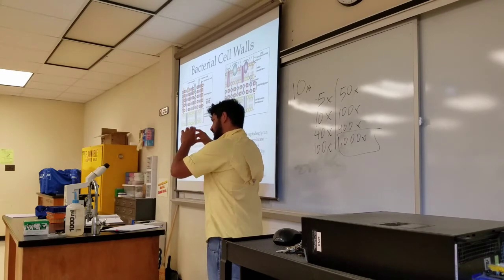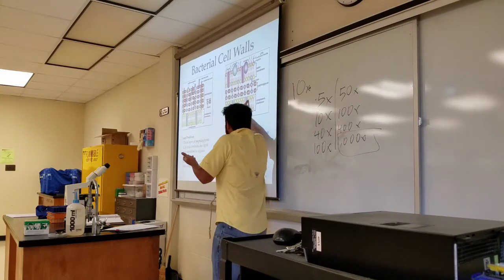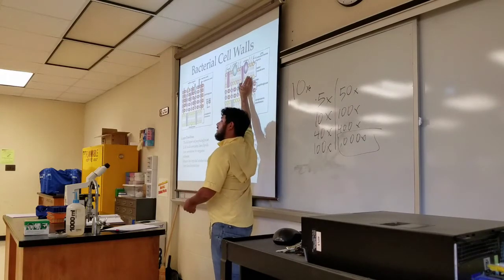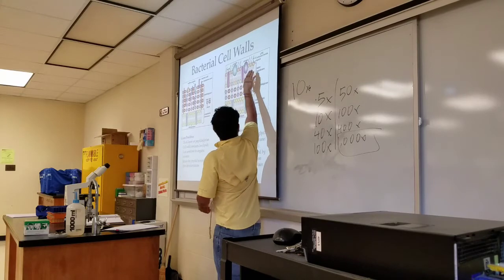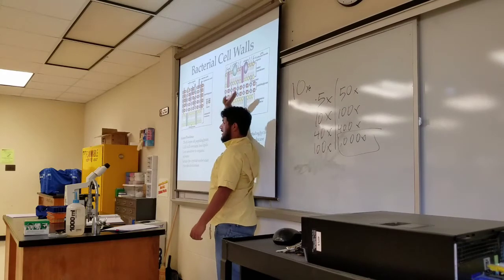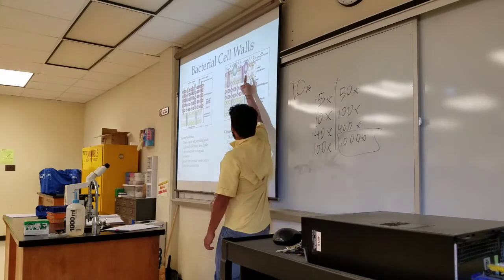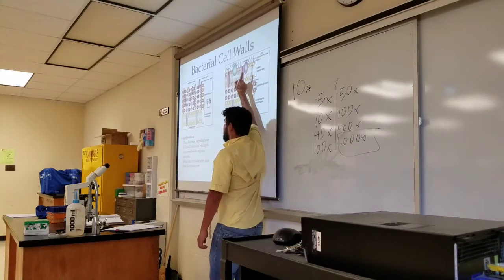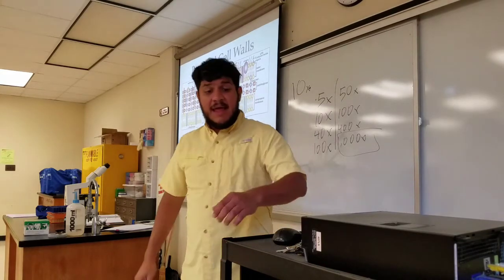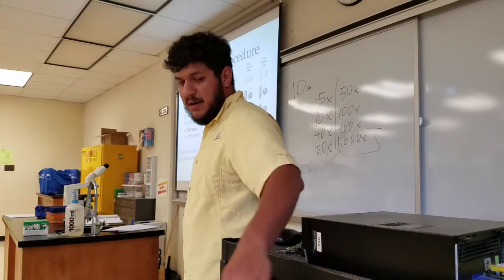And we have fats in the outside of gram-negative bacteria. So what happens is basically with that alcohol, we're washing away the stain and part of the cell wall, all of these phospholipid, polysaccharide and lipid membrane of gram-negative. And what happens with that decolorization is because of this fatty layer on the outside, they lose the stain when we decolorize quicker than gram-positive bacteria. And that's why we're able to differentiate using our gram stains.